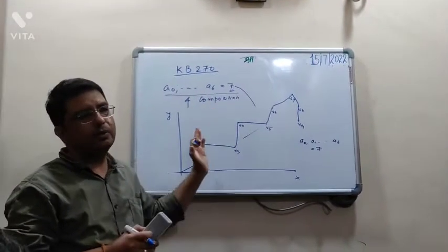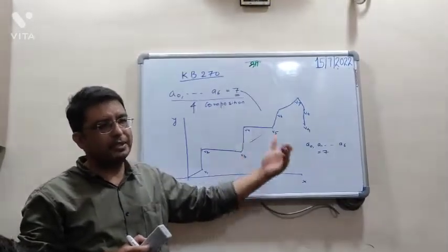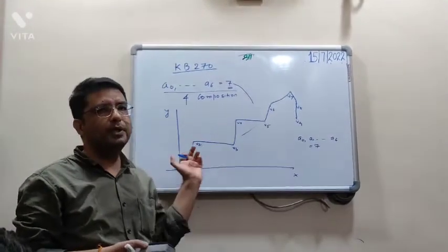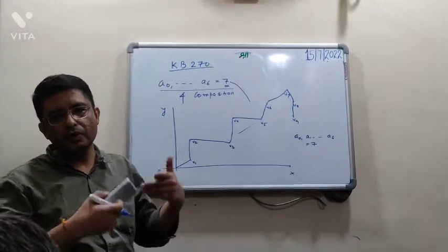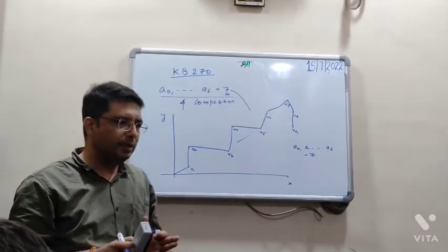I am not saying that you cannot. Minimum 9 is required. So that is their constraint, the instrument's constraint. It's not like you cannot do it. You can do it with 2 points also, but it is the instrument's constraint. Right? So we have to work according to the constraint of the instrument. So, getting my point or not?